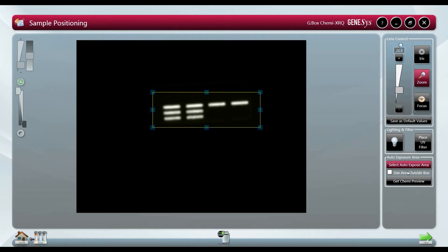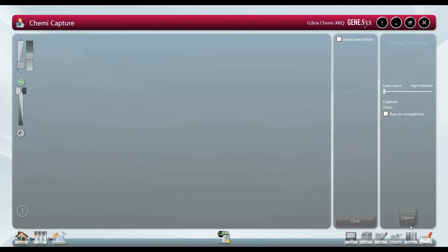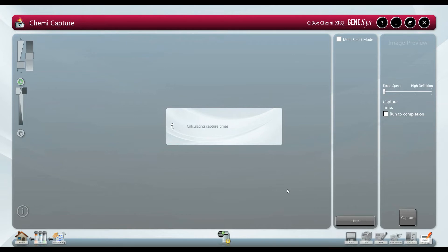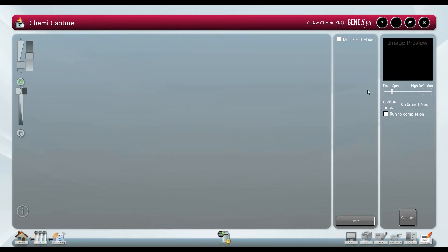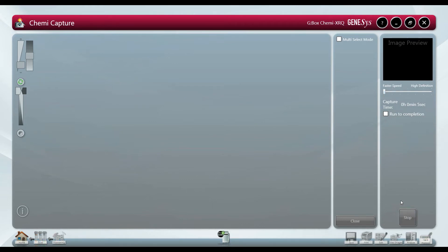Genesis allows the user full control over the image capture parameters so we can capture a high definition image perfect for publication which uses less binning, or a quick capture to check the presence or absence of bands which utilizes more binning.